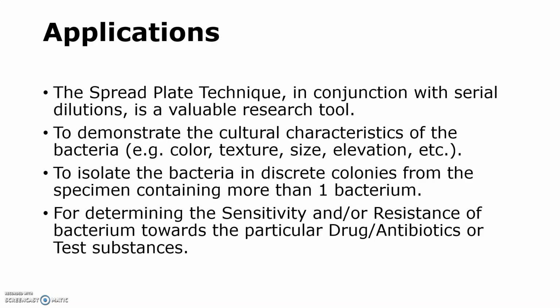It is used to isolate the bacteria in discrete colonies from a specimen containing more than one bacterium. Also for determining the sensitivity or resistance of the bacterium towards particular drugs, antibiotics or test substances.